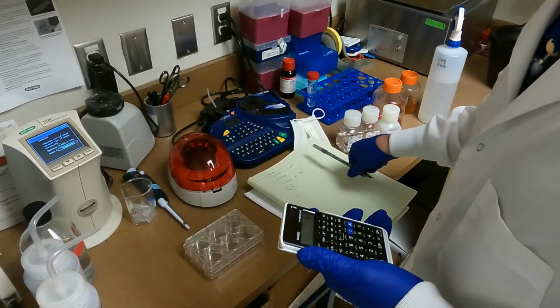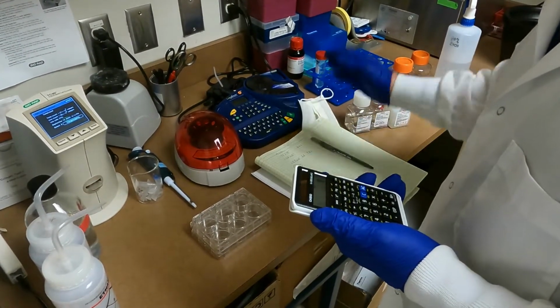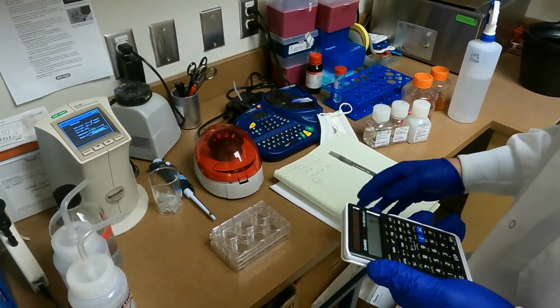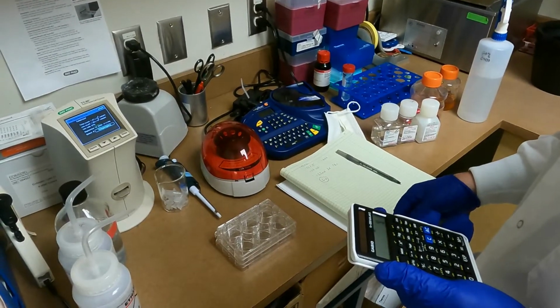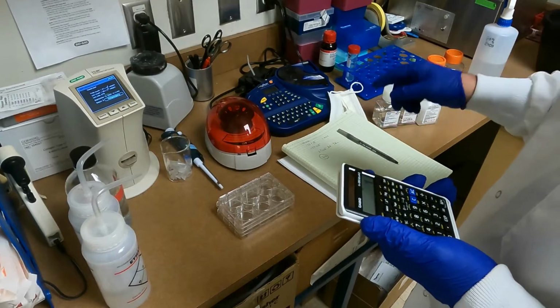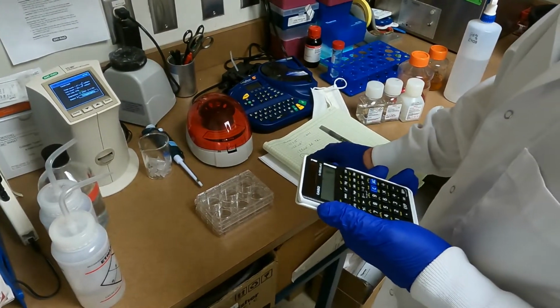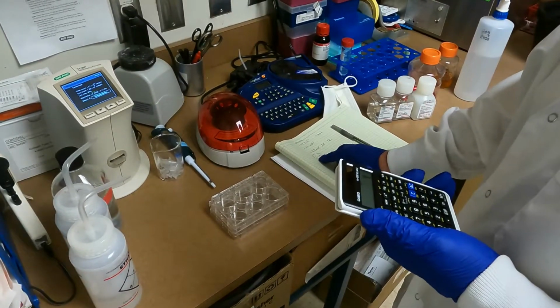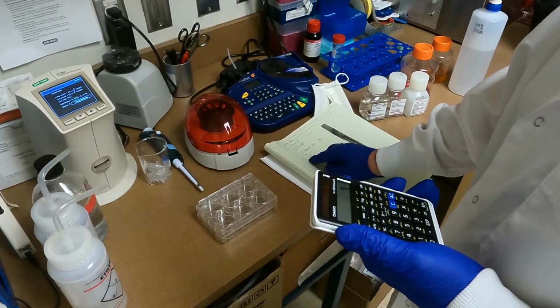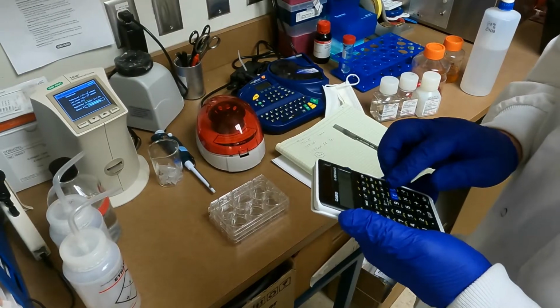So what we can do is we'll pellet them again, wash them back into PBS, and then we'll take the appropriate amount to give us probably 200 microliters at 5 times 10 to the 6. Okay, so we'll do the sums for that. So that's very simple. If you want 200 microliters at 5 times 10 to the 6, you need 800 microliters of these cells. Okay, so that's pretty easy. So we can do that.